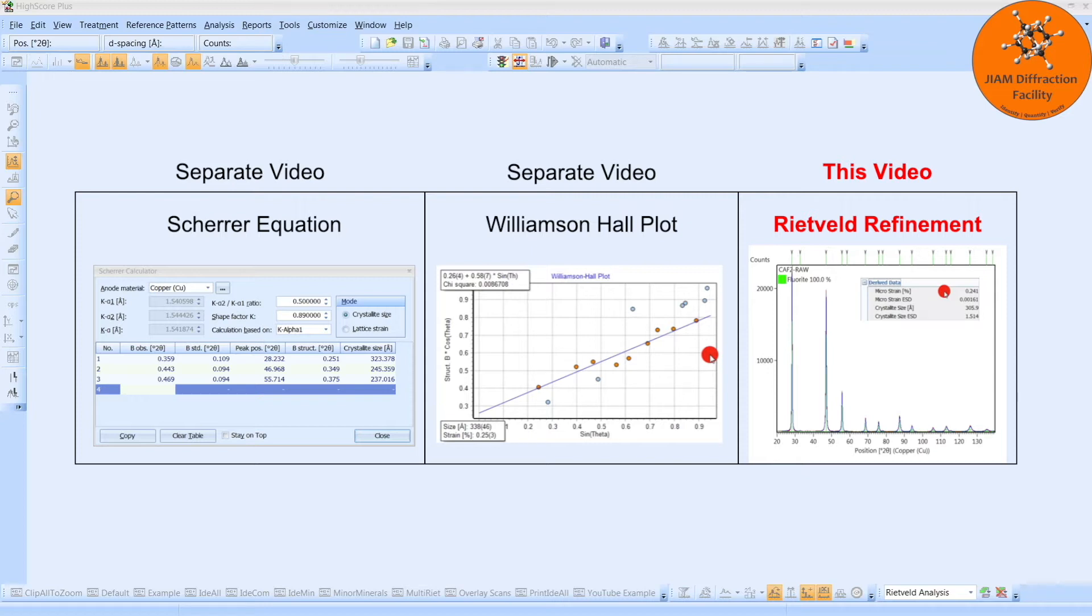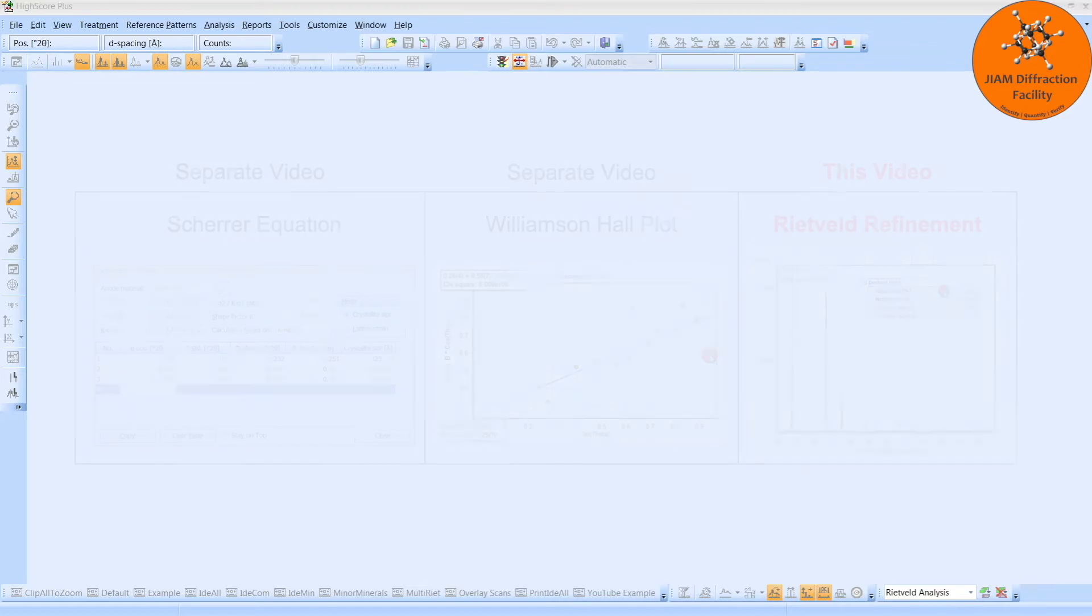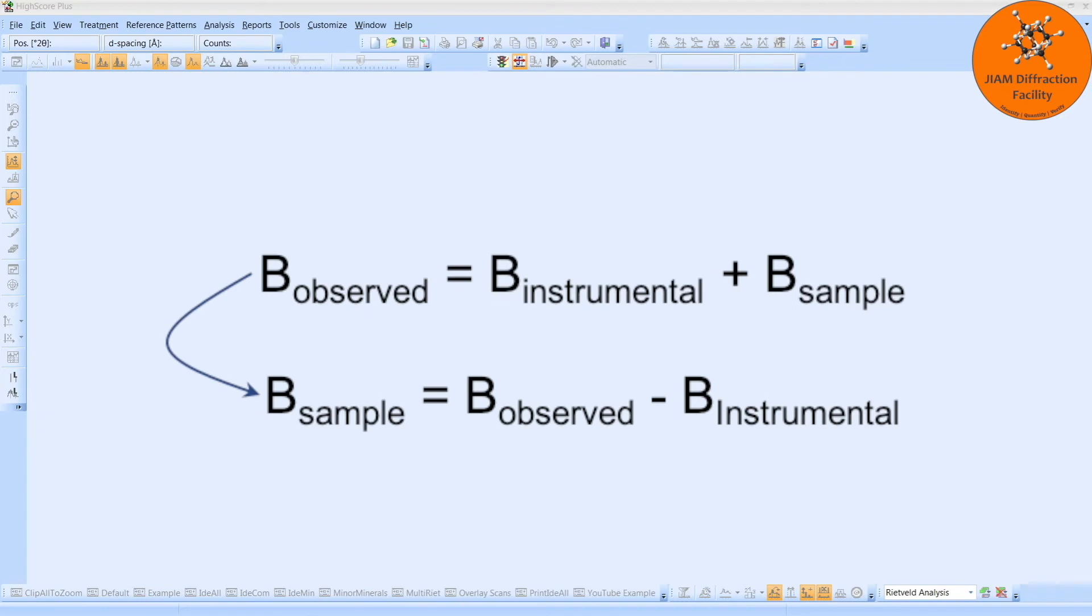These steps are almost identical to my other video except for one thing which I will point out in a few minutes. Just like with the Scherer equation and Williamson-Hall plots, the first step is to determine the instrumental broadening. While this step was very similar for those two methods, it is different for the Rietveld method.